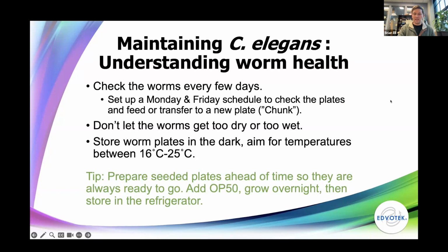Let's see. I think I covered most of this. Don't let the worms get too dry. At the same time, don't let them get too wet either.